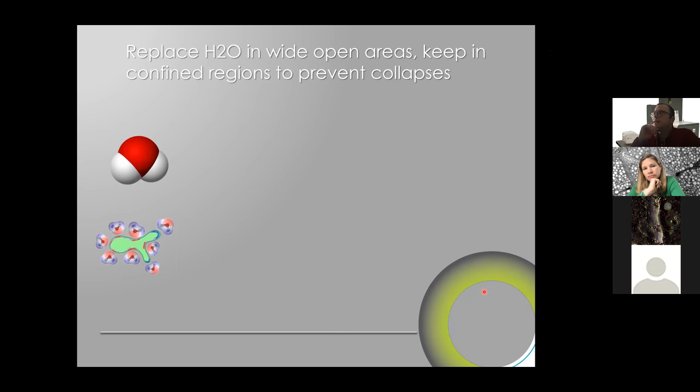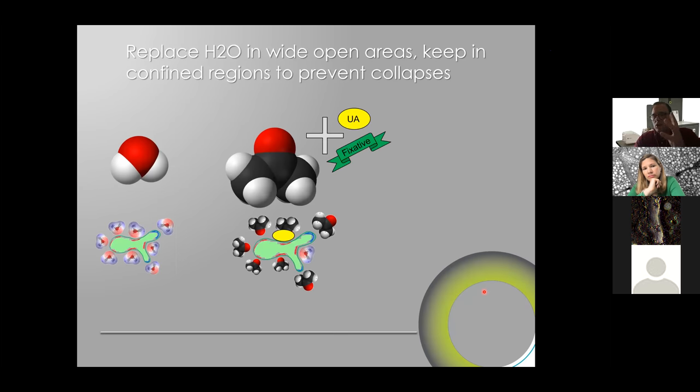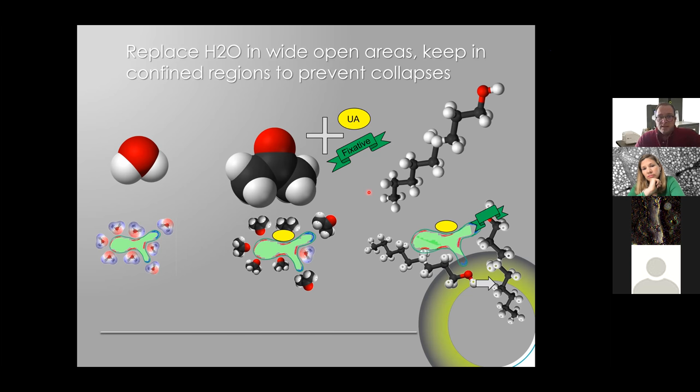That's the concept I just mentioned. We have the water molecules supporting the proteins, and then you dehydrate using acetone, but not fully. So a very small part of the water remains maintaining the molecules. While you add this acetone, you bring in some uranyl acetate or some contrasting agent, a heavy metal salt, together with fixatives. UA is a kind of fixative, but you can also add glutaraldehyde or osmium and other molecules. There are many ways of doing the fixation. And then you replace this acetone by the resin.